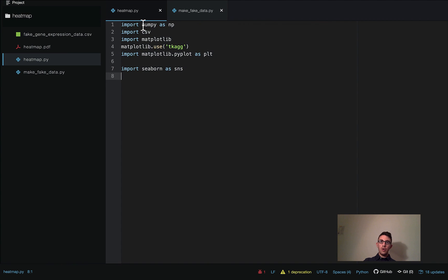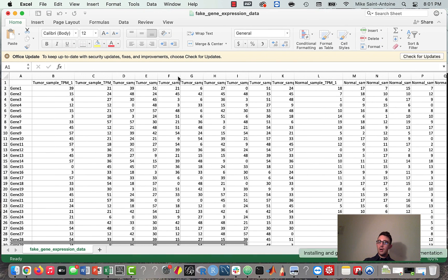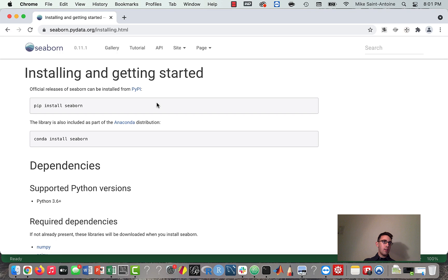We're going to be importing some of our usual libraries — NumPy, the CSV library, and matplotlib. I need a couple extra lines just because with the new Mac OS I have some trouble if I don't include these. We're also going to be using the library Seaborn, which we import as sns by convention. It's a really good library for data visualization and has a really good heat map plotting function that I use a lot. If you don't already have it installed, you can install with pip install seaborn in your terminal or conda install seaborn.